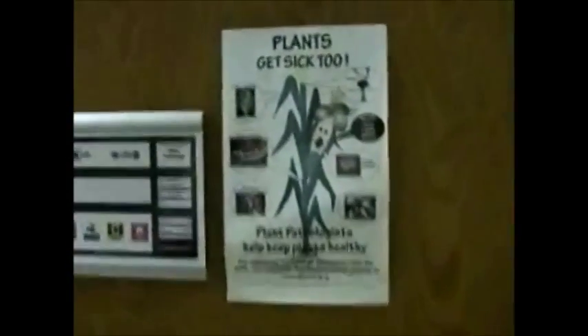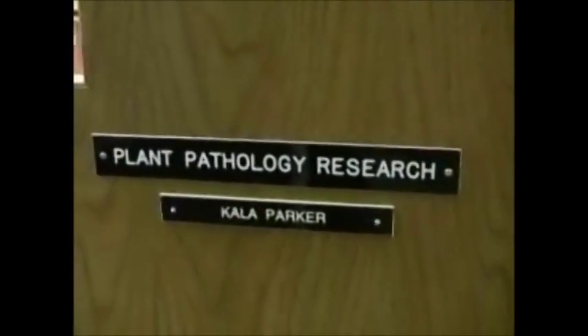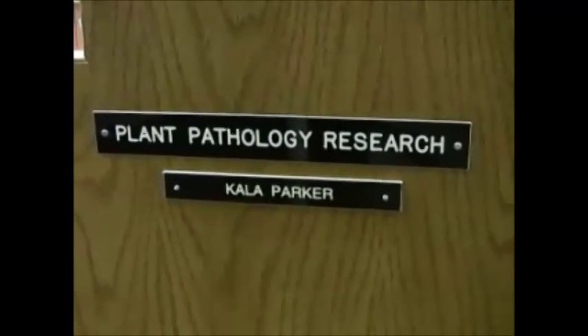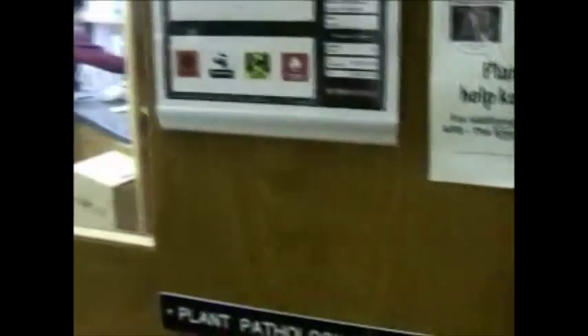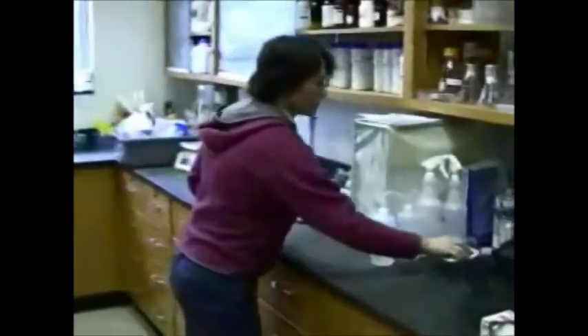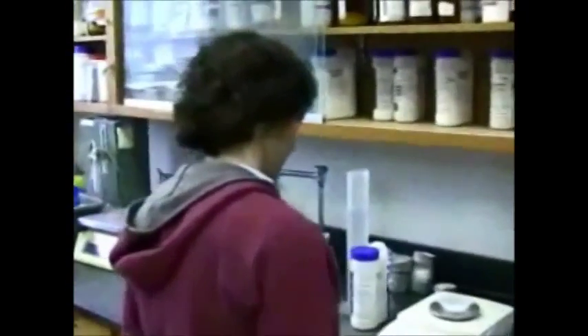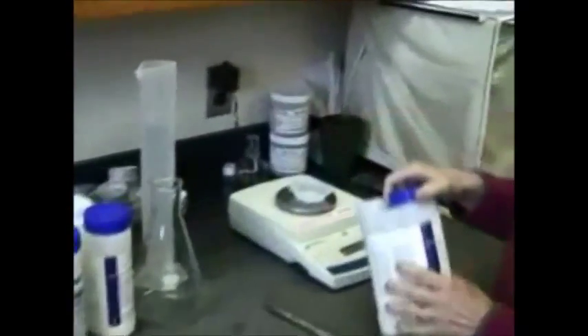There's a sign: Plants get sick too. We're going into the plant pathology research laboratory where my technician Calla Parker is getting ready to make some agar medium today. So let's follow Calla into the lab and watch her as she prepares. Today she's making cornmeal agar for some of our phytophthora cultures. I'm going to get out of her way and let her go to work.